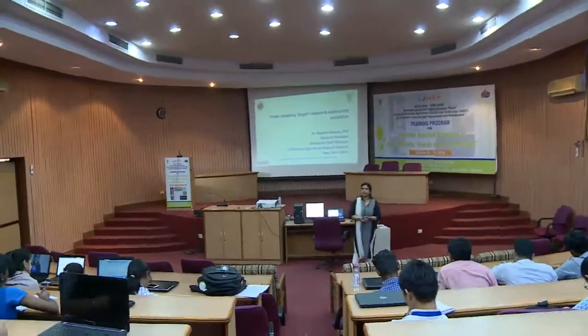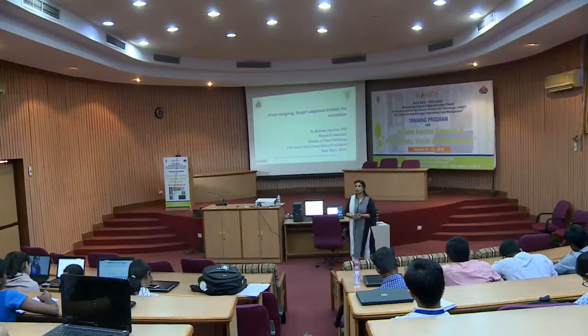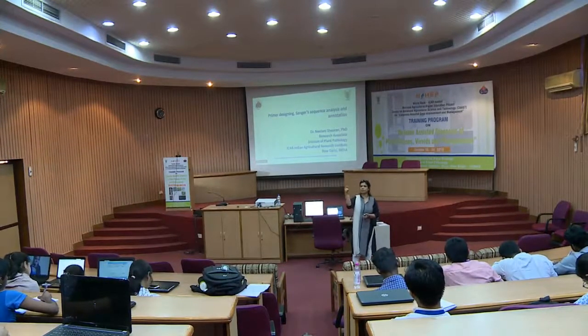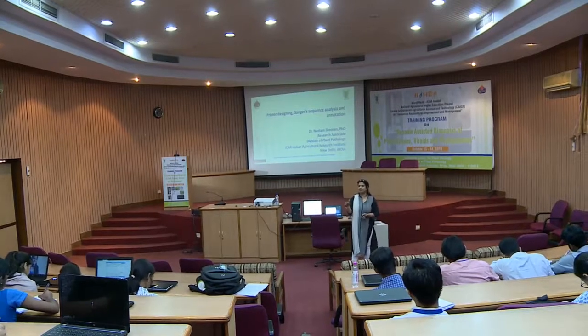Then the fourth point is to avoid the repeat region. Let us suppose some repeat is there, a stretch of T nucleotide or C nucleotide or A nucleotide, you avoid that region.